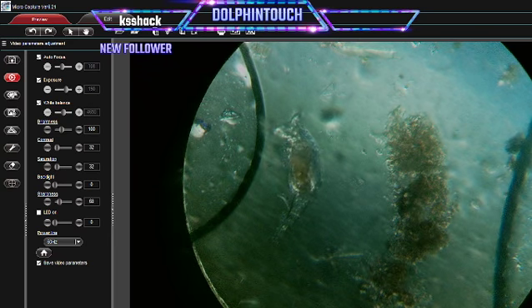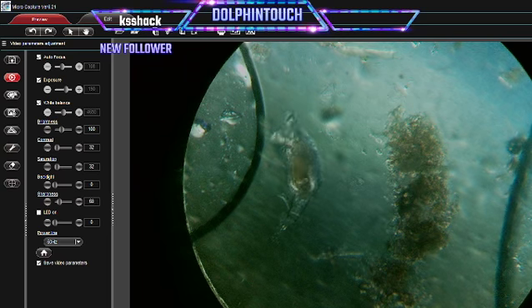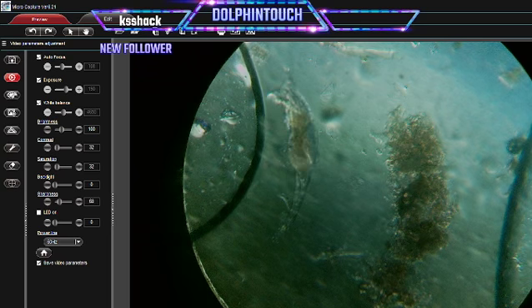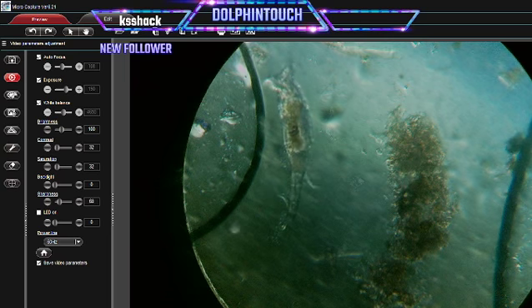It's... I forget the name of it now. It can stretch itself right out, if I'm correct. That is, I'm not exactly sure. And that thing at the front has all little hairs. It's his mouth.